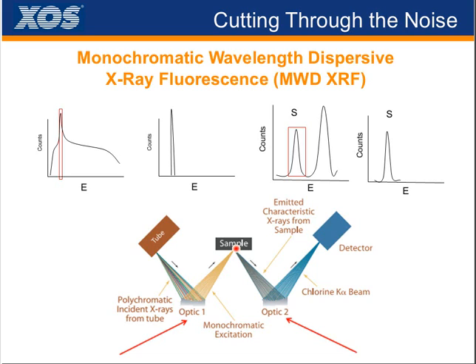And then when the fluorescence is coming off the back end, it's hitting this second optic, which would be used for what we would basically amount to filtering.